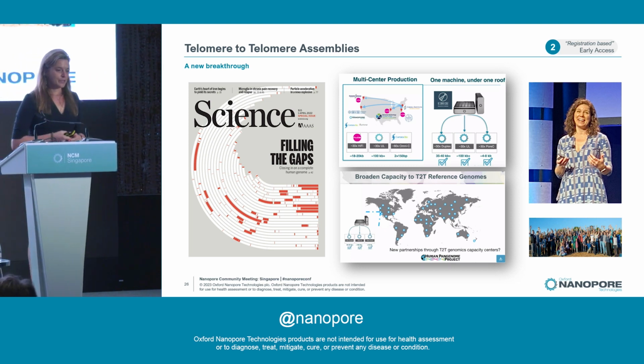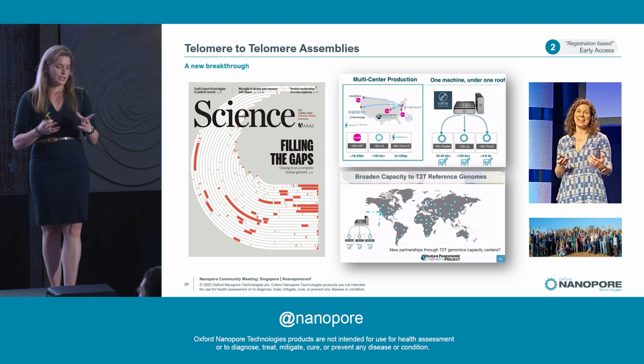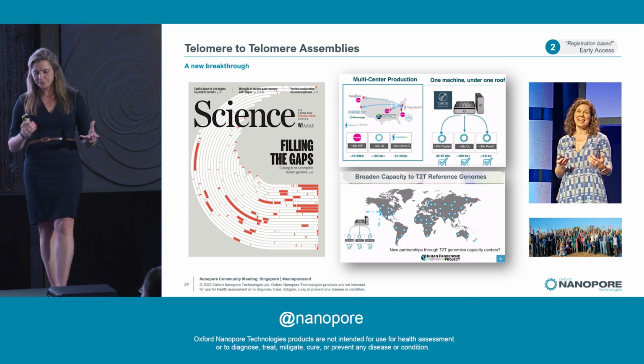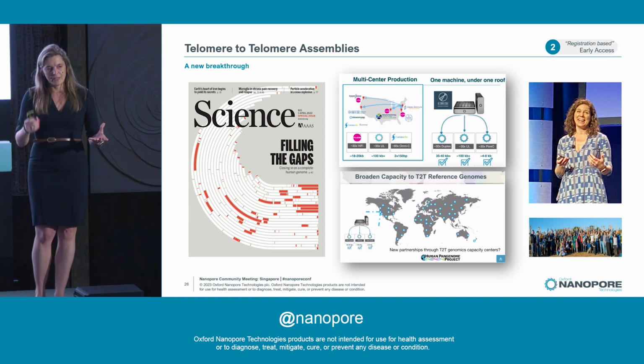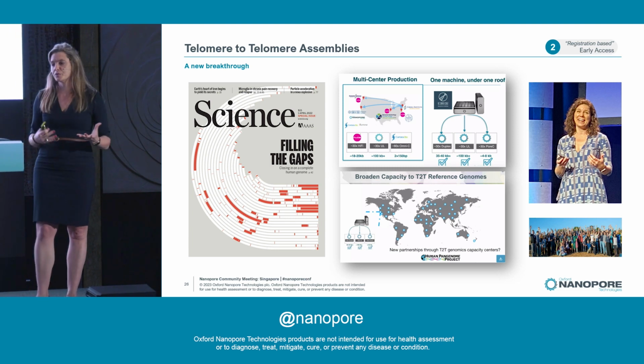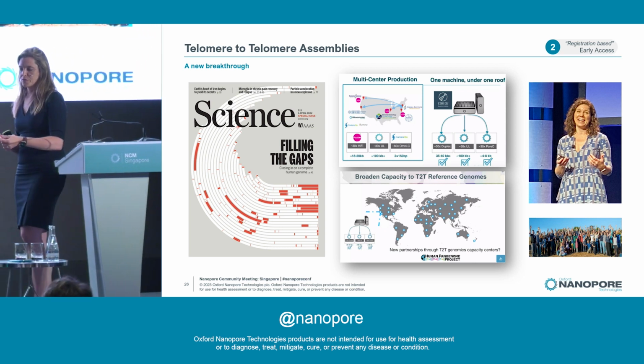This is Karen Miga, this is her HBT talk from February this year, and she was explaining that the initial T2T came together, it was multi-center, multi-platform, but if we're going to accelerate the generation of telomere-to-telomere, it needs to become simpler, much easier to use. And so there's the drive to try and get it all onto one platform.